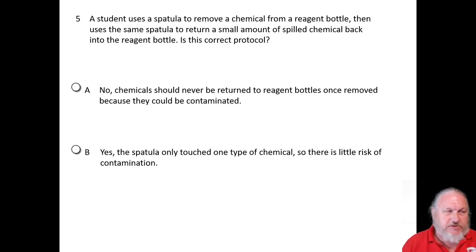So a student uses a spatula to remove a chemical from a reagent bottle, then uses the same spatula to return a small amount of spilled chemical back into the bottle. Is this correct protocol? No, chemicals should never be returned to the reagent bottles once removed because they could be contaminated, or yes, the spatula only touched one type of chemical so there is little risk of contamination? Well the answer is no, you should not because that stuff is contaminated.